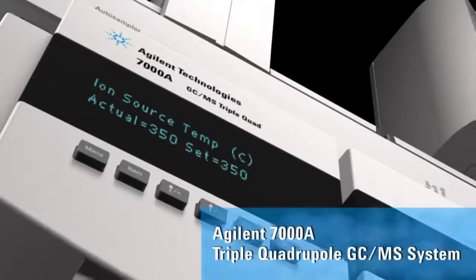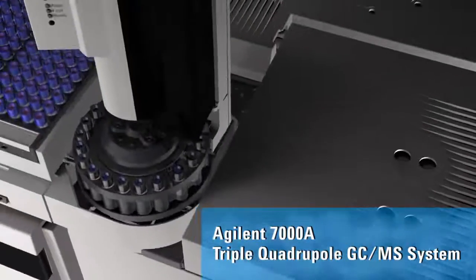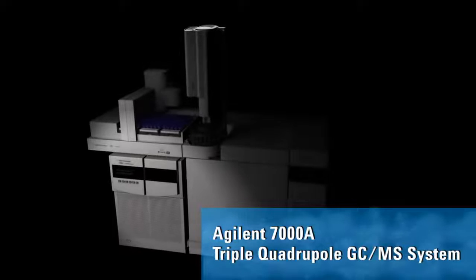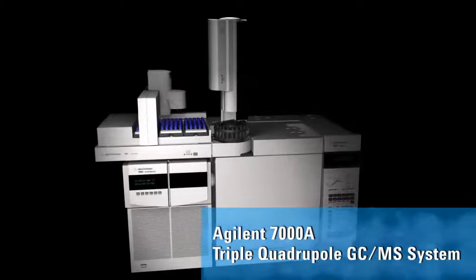The Agilent 7000A Quadrupole GC-MS-MS system, an MS-MS optimized for trace analysis of your most complex GC samples, the new standard for GC-MS-MS performance.